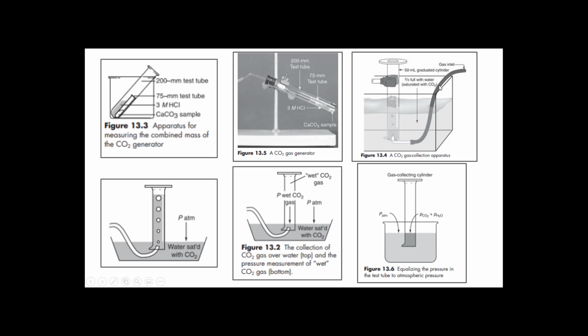If this was to be on this side, you would have a larger beaker to do this in. And this is why it takes a long time of prep for most students, because it's really hard to get this done. So you have this rubber tube that has another little glass tube outlet, whatever you want to call it, and you stick it underneath the graduated cylinder.